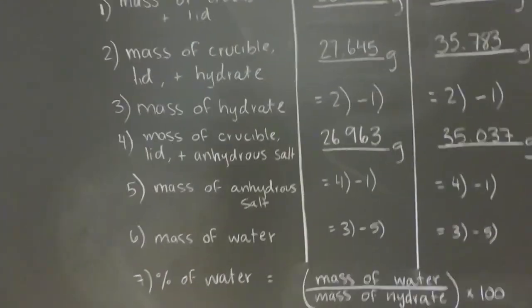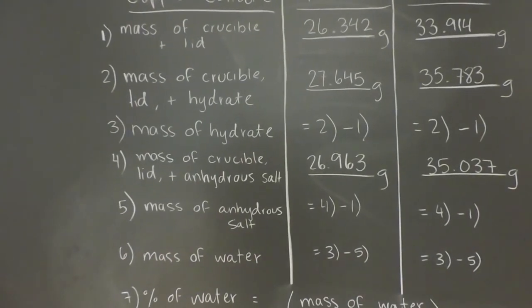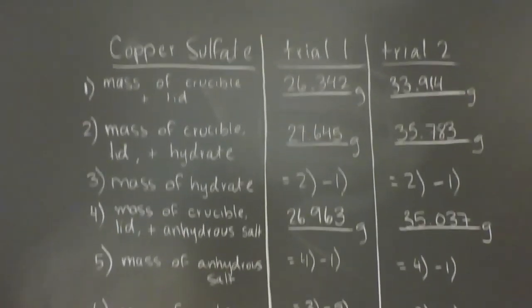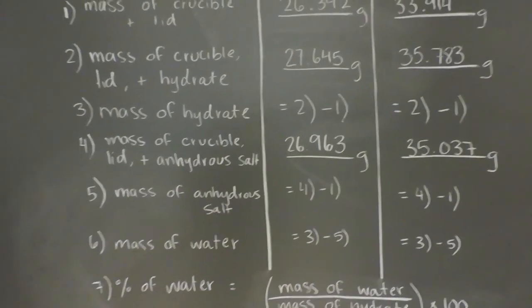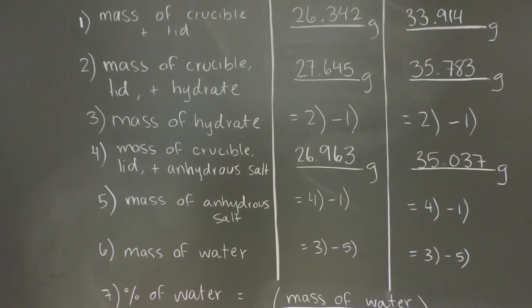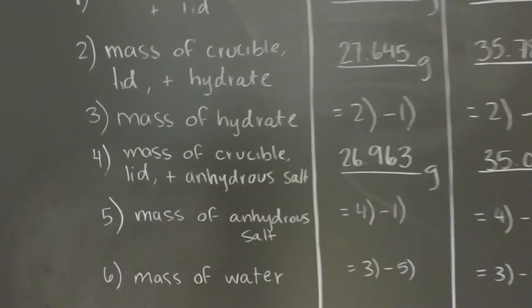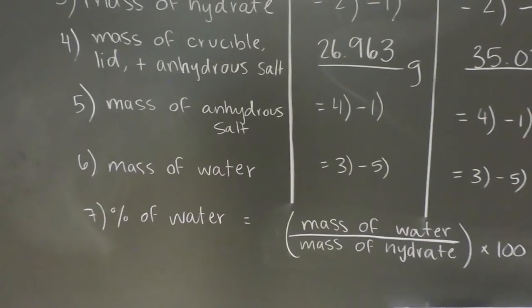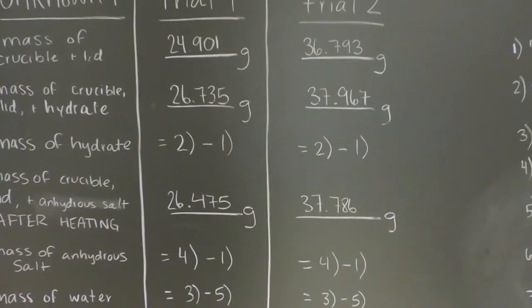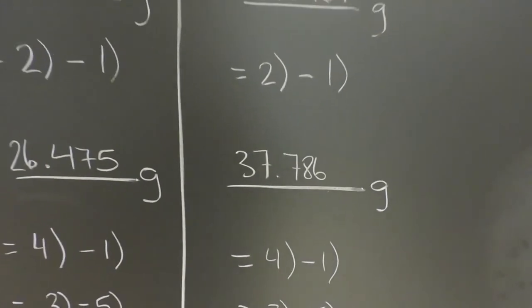Notice, for entry number 5, the mass of the anhydrous salt, you can take entry number 4, which is the mass of the crucible, lid, and anhydrous salt, and subtract entry 1, the mass of the crucible and the lid. From there, you will get the mass of the anhydrous salt. The mass of the water is entry 3, the mass of the hydrate, minus the mass of the anhydrous salt. The difference gives you your mass of water. For trial 2 of the unknown hydrate, after drying, the mass of the crucible, lid, and anhydrous salt is 37.786 grams.